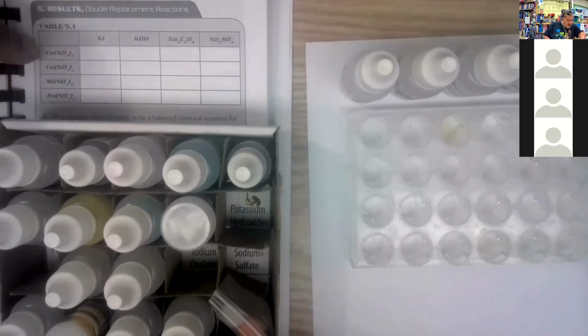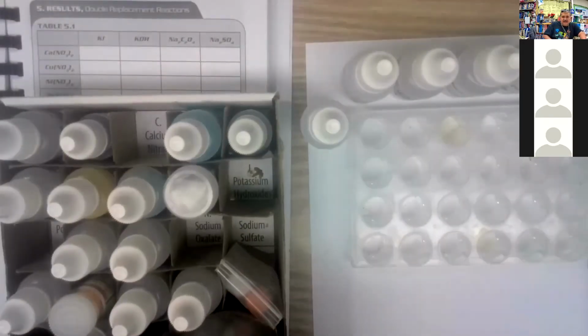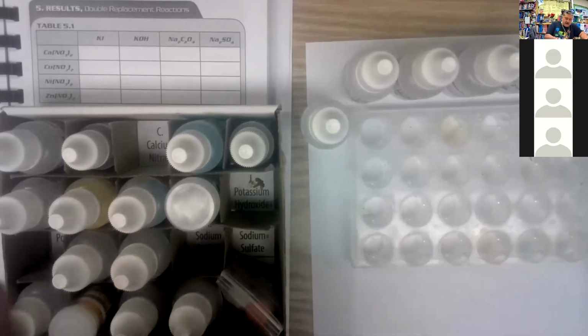Over here we have the calcium nitrate. Calcium nitrate is the third one over, first row. Okay. Next one, I can't see it, but there you go. That's copper nitrate. Looking at the inside cover of my box, copper nitrate is first row, fourth over. So there's the second one.